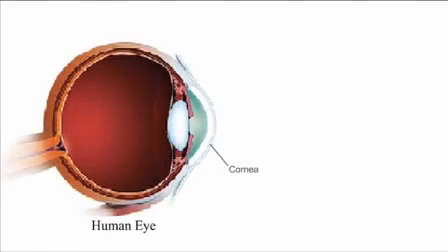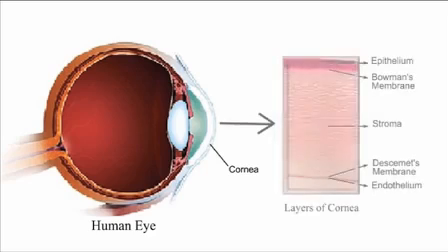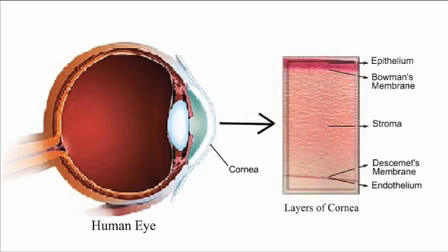The cornea is an avascular tissue which enables the transmission of light onto the retina, and for this purpose should always maintain a good degree of transparency. The cornea comprises 5 layers: the epithelium, Bowman's layer, stroma, Descemet's membrane, and endothelium. If the cornea is damaged, it can be replaced with the help of a suitable donor cornea.